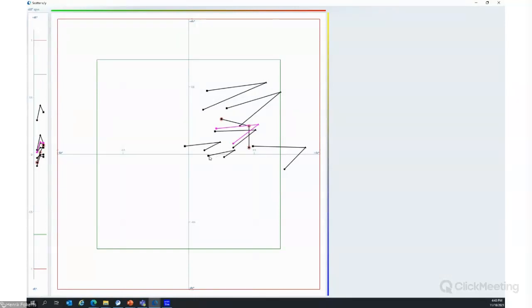When you see here, this is sample number 5. The results for all 3 light sources are more or less in the same area. So no big difference between the light sources and the delta numbers for the light sources.